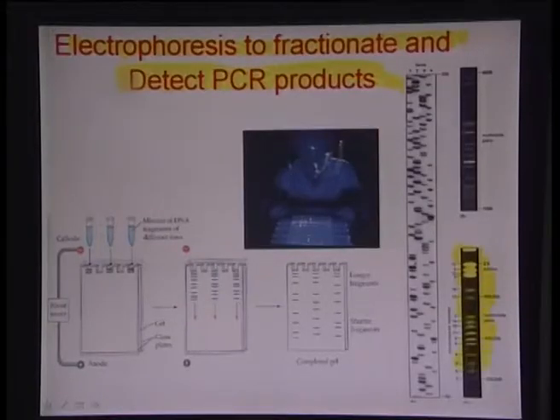as you are seeing here, this figure shows these bands, right? These are fluorescent bands. The fluorescence comes again from the intercalation process between the DNA of a certain size and the fluorophore material which is present in the medium of interest. So you have these different bands starting from 2.5 million, 950,000, about 610,000, 220,000, and so on and so forth. These are nucleotide pairs, the number of pairs that are available.